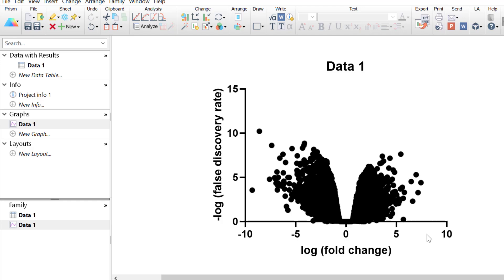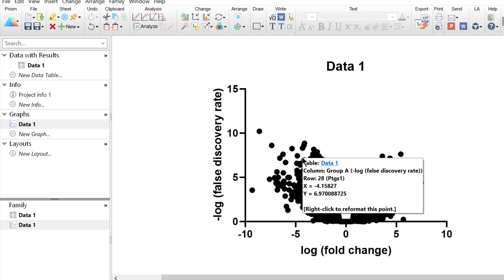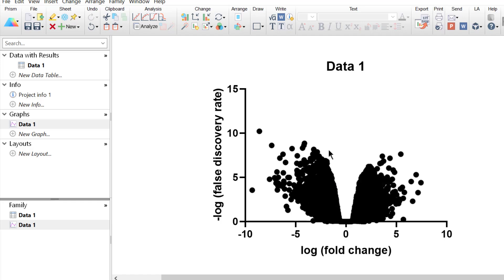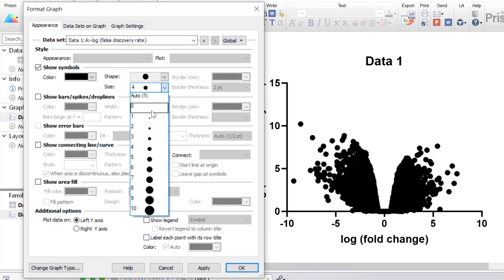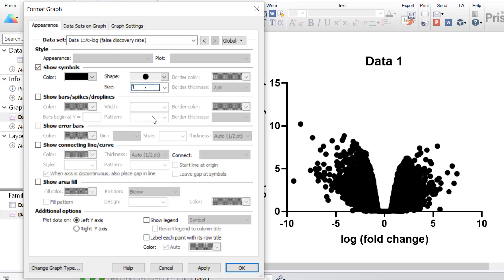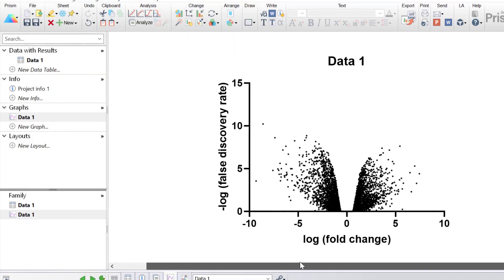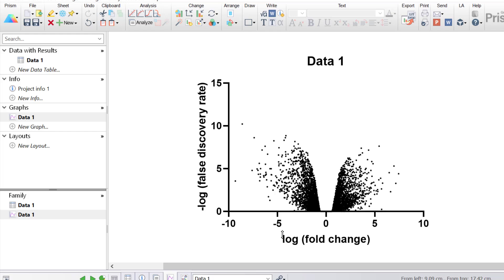Now the Y-axis begins at X equals negative 10, and we can see all of the data points on the graph. However, because there are so many data points and a lot of them are overlapping considerably, it's very hard to see how many data points we have. To make it easier to visualize, we can make the data points smaller. To do this, I'll go to the Format Graph button at the top and change the symbol size from 4 to 1, which is the smallest size possible. Now the data points are considerably smaller and we can see a lot more of them.